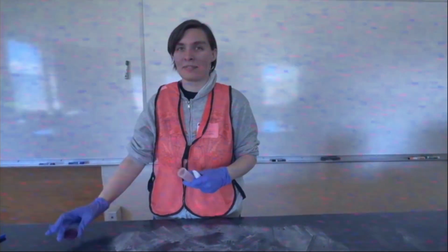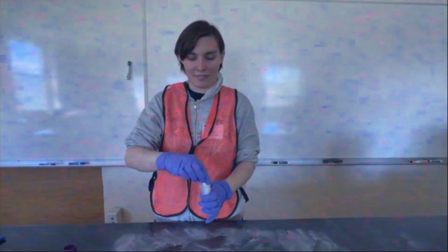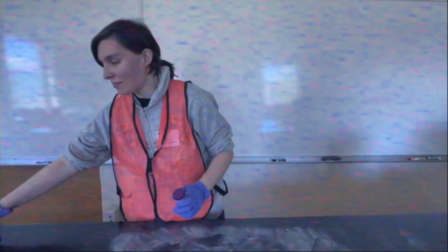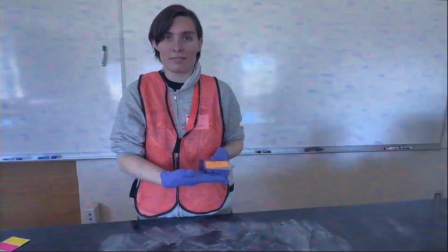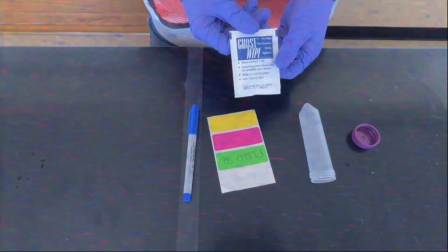Upon completion, the sample is placed into an appropriate container. An industrial hygienist always labels their samples. A sample without documentation is simply a mystery with a lid on it. The sample is now contained, much like the excitement in this film.